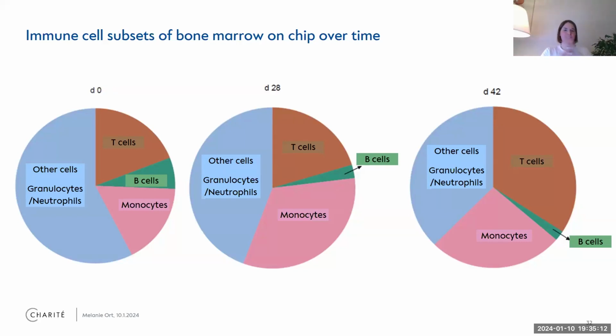And here you can see the big subsets of immune cells. Those are all the cells that make you survive any kind of viral, bacterial, or whatever infection. And we do maintain T cells and B cells and monocytes and all of them over time. But of course, I cannot fool you. You see that there's a lot of change. So of course, we have cells dying.